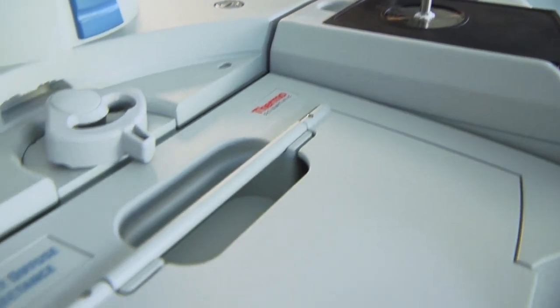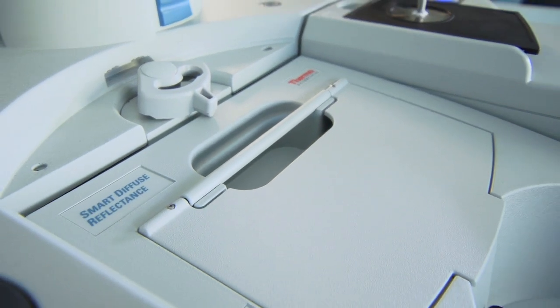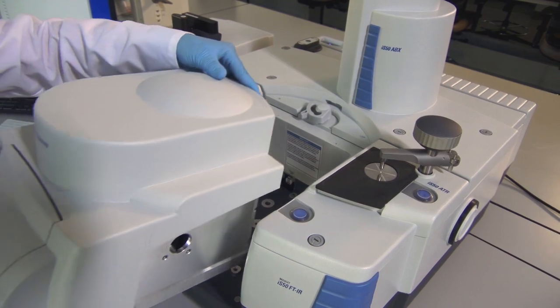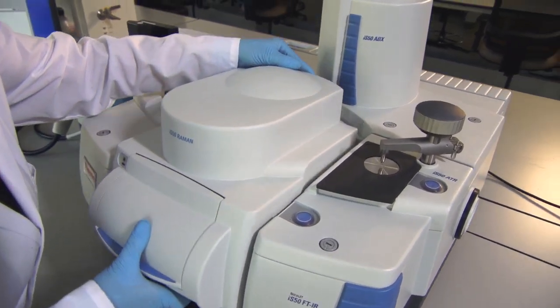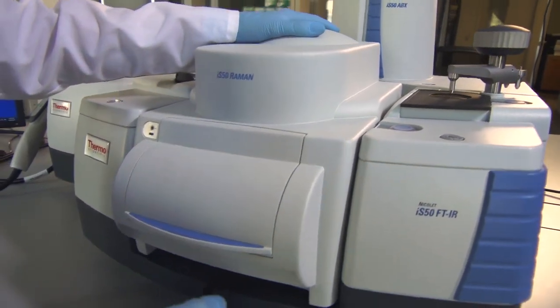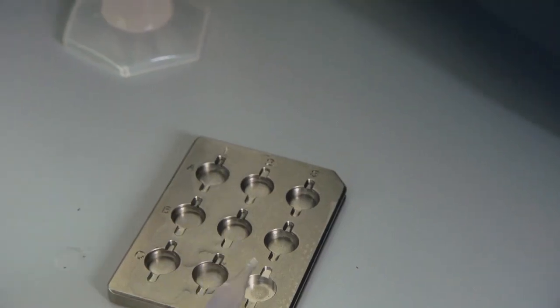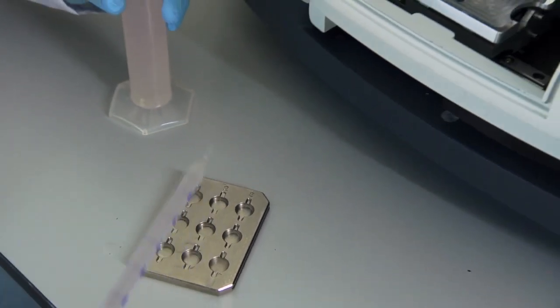Since the ATR is built in, your sampling compartment is free for any other accessory. For example, working in tandem with the built-in ATR, the IS50 Raman module lets you rapidly switch from mid-infrared to Raman without reconfiguring optics or waiting for the instrument to stabilize.